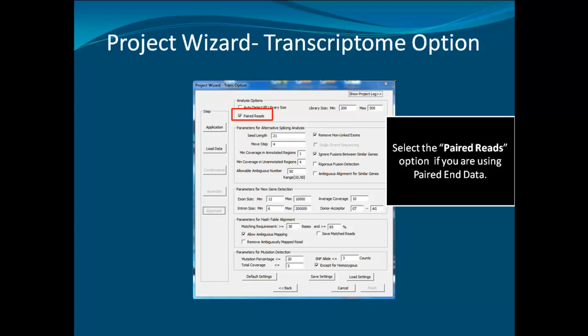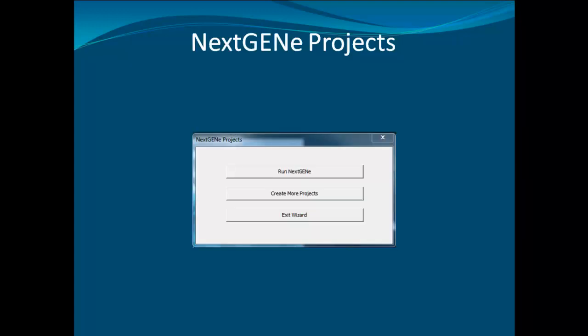When you are satisfied with the settings, click Finish. In the final window of NextGene, you can either select to run the current project or create more projects for batch processing. I would choose to run NextGene.